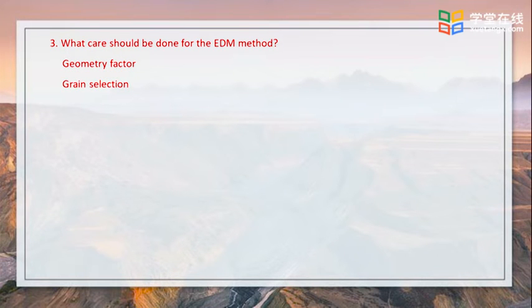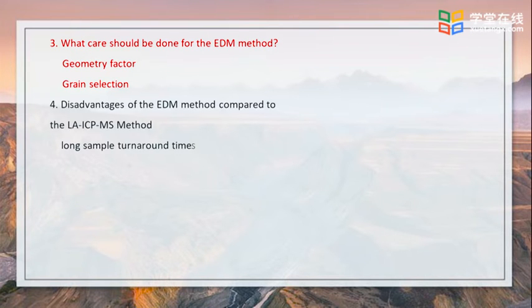A very careful selection of grains with the highest etching efficiency surfaces, as identified by sharp polished scratches, is therefore essential for the EDM. Also, because ages can be measured on individual grains, a careful selection of grains can be made to avoid those which may be badly etched or contain dislocations.